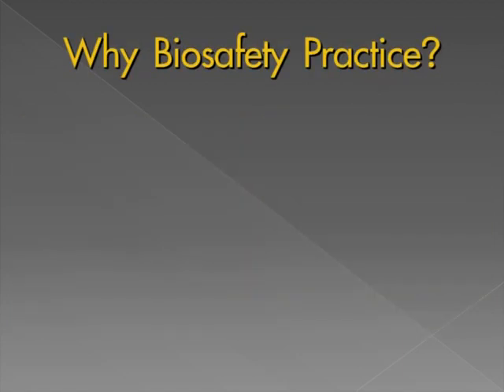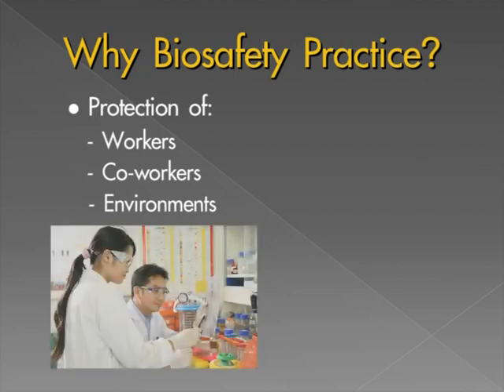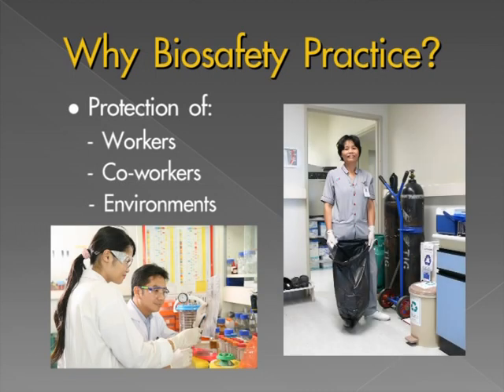Why practice biosafety? A fundamental objective of the biosafety program is the containment of potentially harmful biological agents in order to reduce or eliminate exposure of laboratory workers and other persons, and prevent the release of biohazardous agents to the environment.